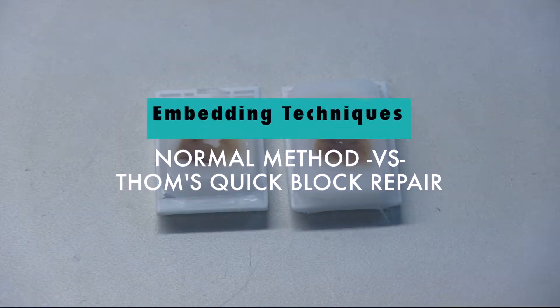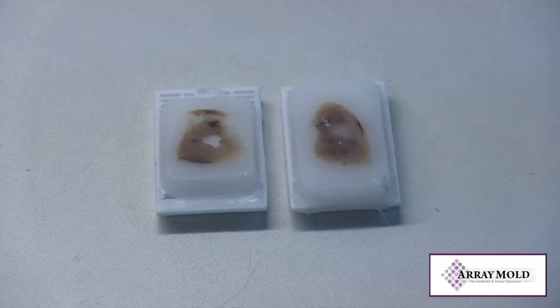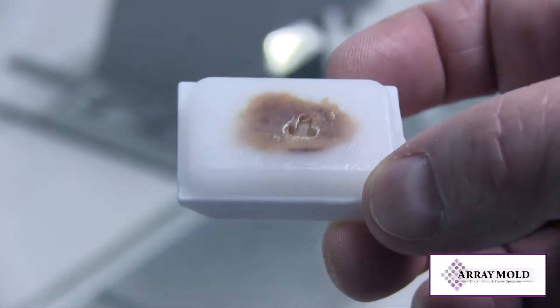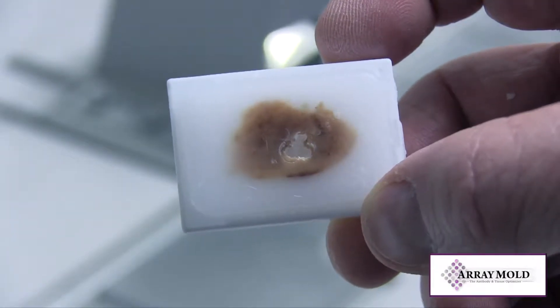I'm going to cover two different ways of re-embedding paraffin blocks. The first procedure is similar to what's done in most histology labs, and the second is a quick block repair technique that I've been using for years.